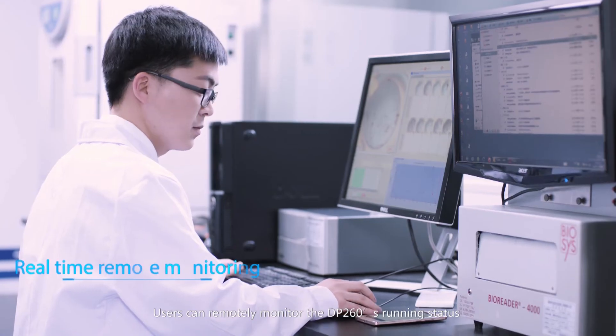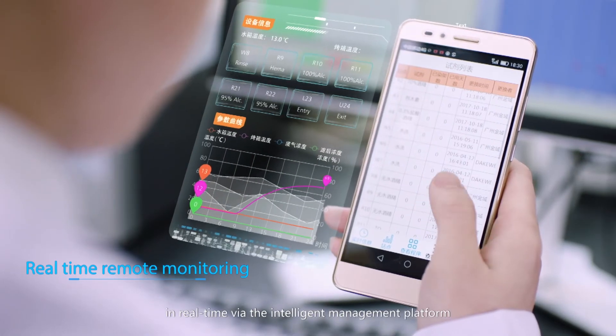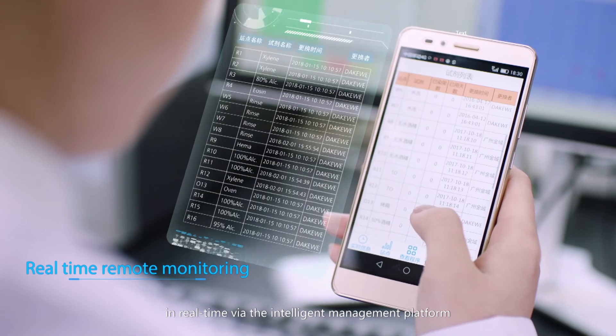Users can remotely monitor the DP-260's running status in real time via the intelligent management platform.